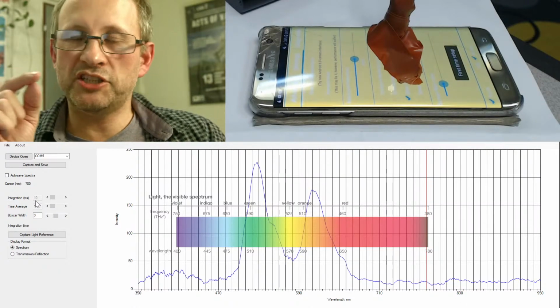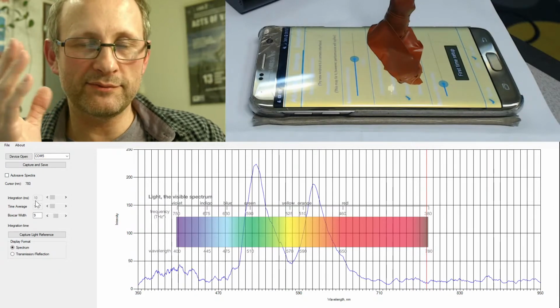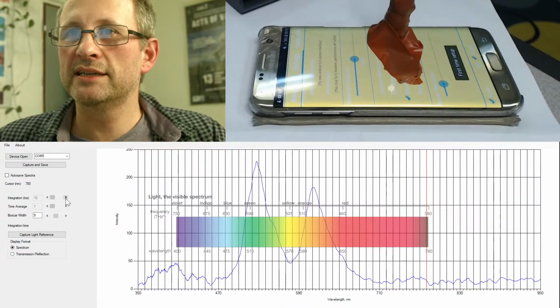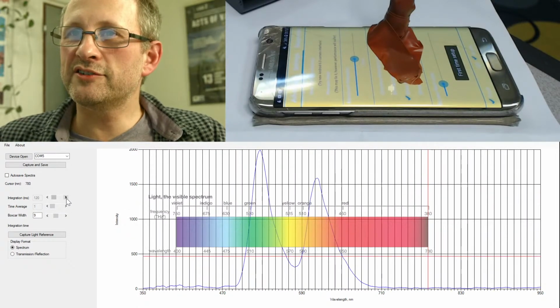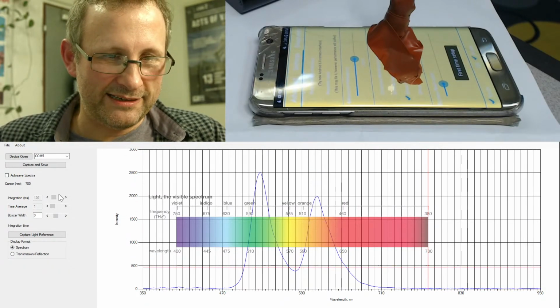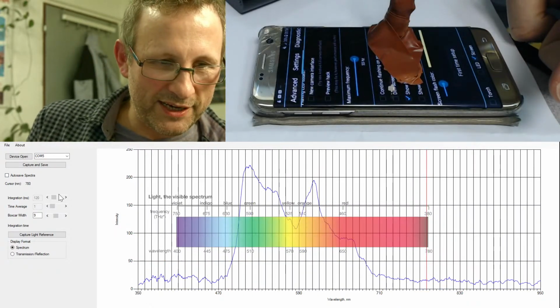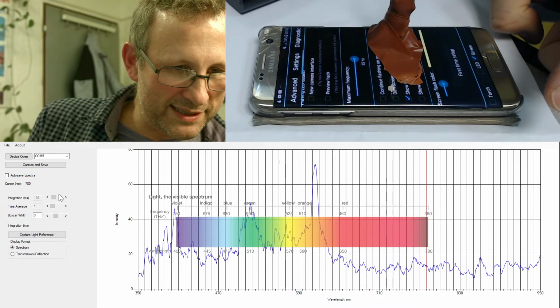And I found that actually this was one way you could partially solve the clipping, but really it's losing a bit of data when it's clipping, when it's too bright. And so if I actually change the integration time here up to 120 again, you end up with a very smooth curve. And so that's really showing. So I'm going to switch to black, and you can see that drops down to very low count numbers.